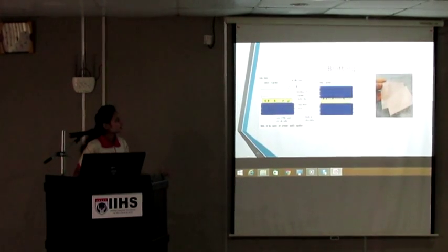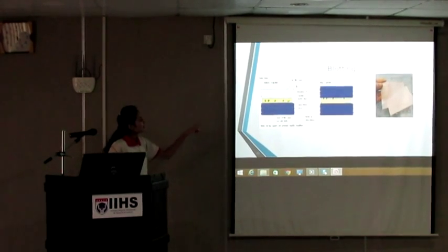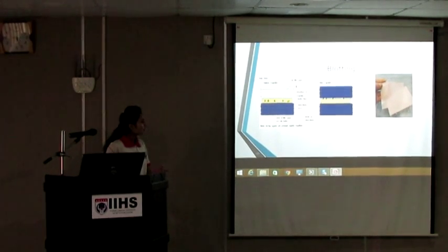And this is the blotting. Here, you can see the yellow one is the gel, and above the gel there are white papers. They are called blotting nitrocellulose paper. There are drops; suppose they are DNA fragments, DNA bands. After some time, the DNA bands are transferred from the gel to the nitrocellulose paper. This is called blotting.